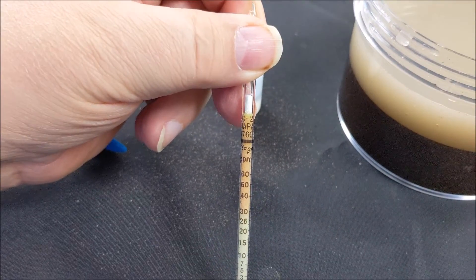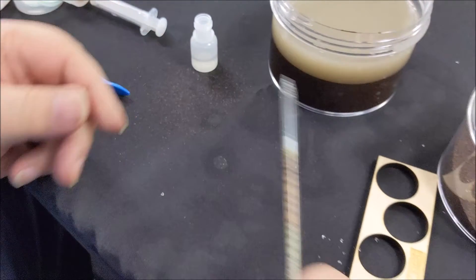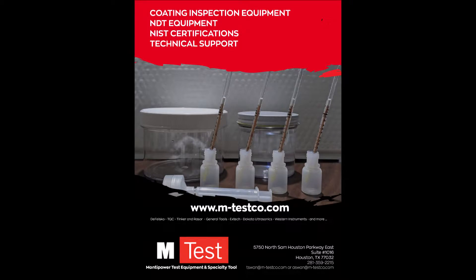Note that the Katagua tube reads in PPM. Make sure you check with the abrasive manufacturer or the specifications to determine the maximum amount of chlorides allowed. When testing for chlorides, this method does not comply with the ASTM standard and you are not testing for total salts. Also note that the distilled water from any drugstore or supermarket should be free of chlorides. If you question it, use one of the Katagua tubes for reference.